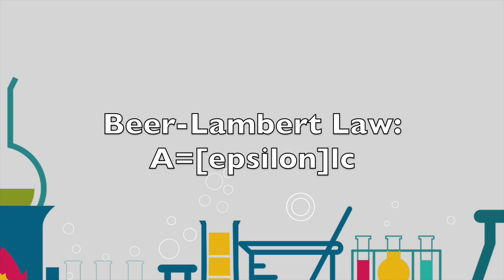Beer-Lambert's law is extremely important for this experiment. Beer-Lambert's law states that absorption of a solution is equal to epsilon times the length of the solution the light passes through times the concentration of the solution. Epsilon in this equation represents the molar absorption coefficient of the solution.